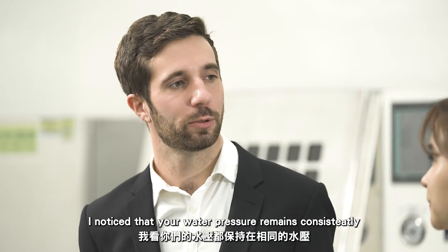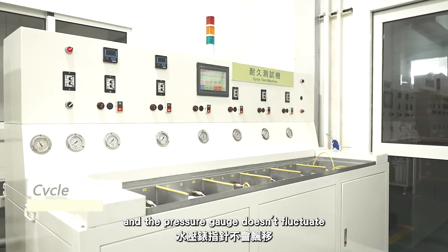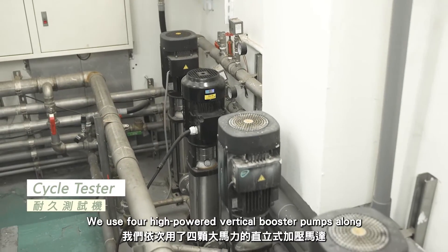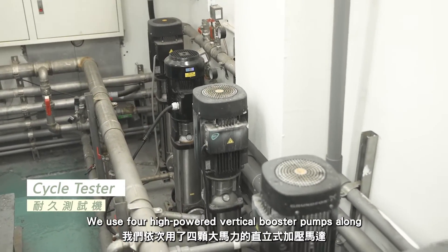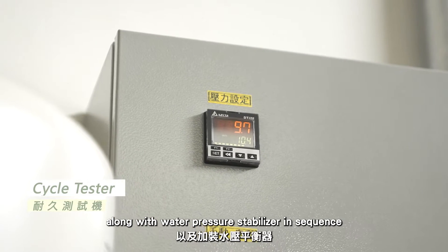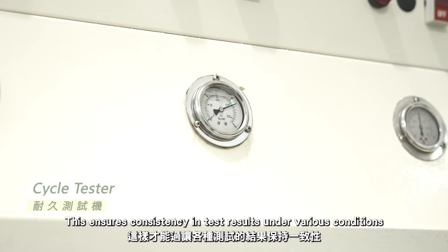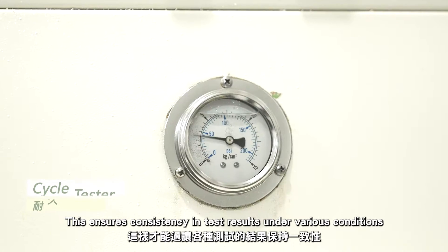I notice that your water pressure remains consistent and the pressure gauge doesn't fluctuate. How do you achieve that? We use four high-powered vertical boost pumps along with a water pressure stabilizer in sequence. This ensures consistency in test results under various conditions.